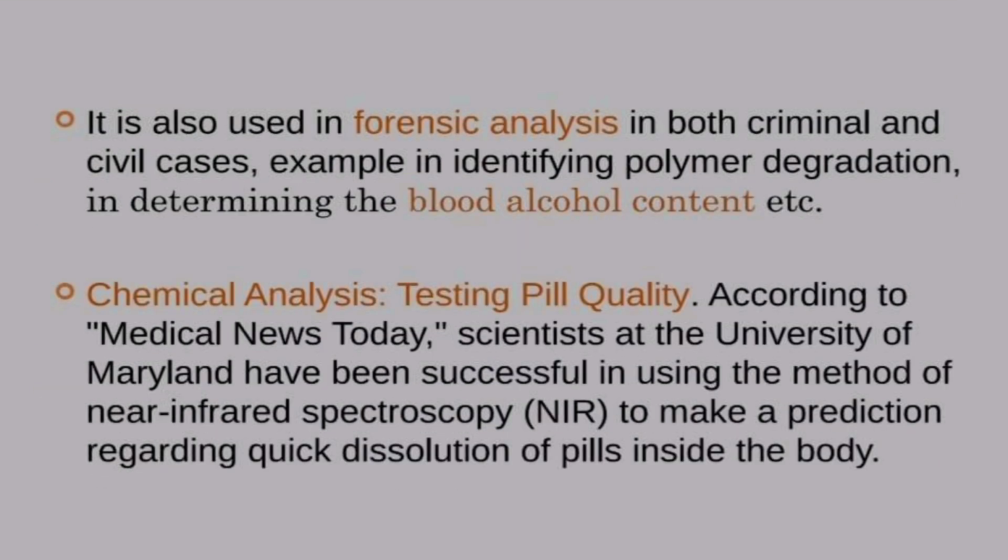It is also used in forensic analysis in both criminal and civil cases, for example in identifying polymer degradation and in determining blood alcohol content.